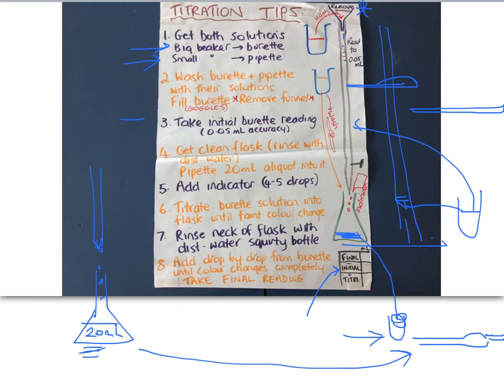When that color change happens and it's gone pink and it's stayed pink after you've rinsed it down with the water bottle, so you've rinsed it down and the pink color stayed, you want to take your final reading. And your final reading you'll now record onto your table. And that will allow you then to get your final reading minus your initial reading, and that will give your final titre.